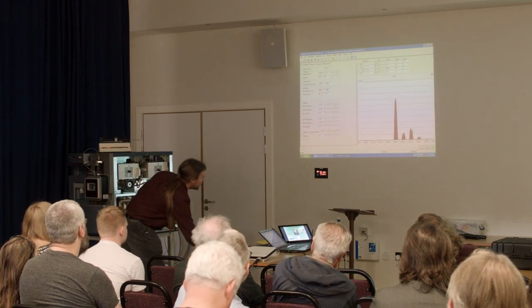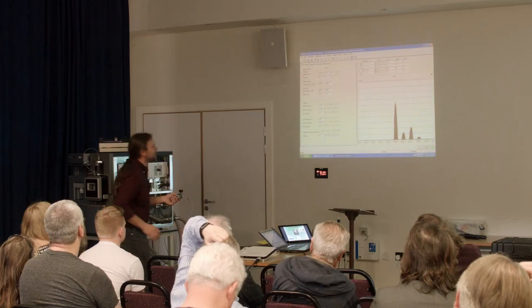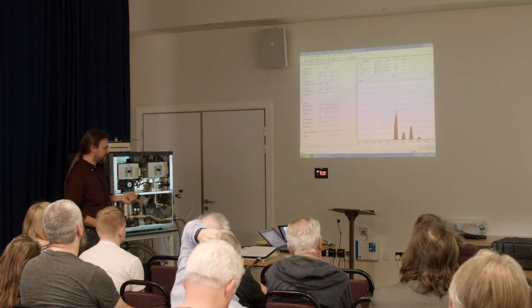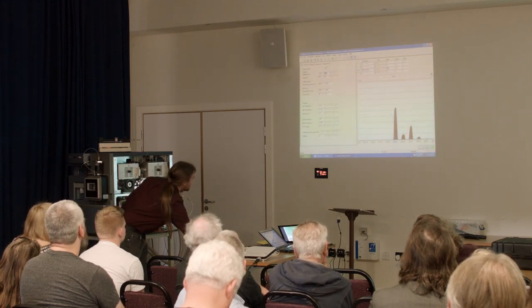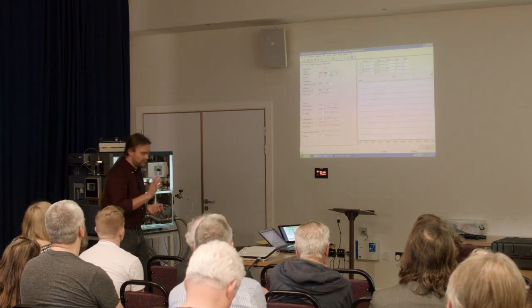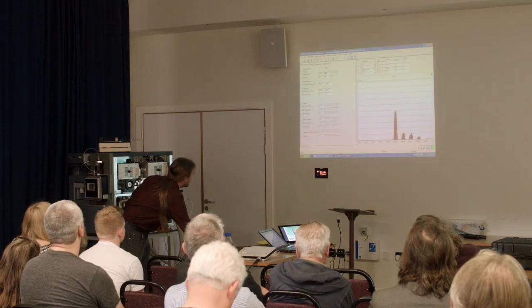And what we could try and do is just fragment it. So now we have the peaks here, they're looking quite nice. I'll just show you what this does. This is the capillary voltage. If we turn this down, this is the ionization. So this is the high voltage on the ionization. If we kill the high voltage, we stop the ionization.